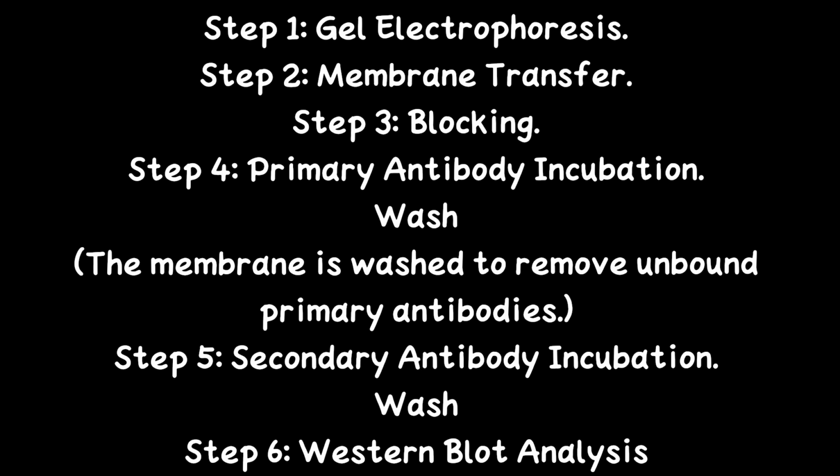that is, analysis is available. So the separation is by SDS-PAGE, blotting is transfer to the membrane, then it is blocked, which prevents non-specific binding, antibody 1 is the primary, and then binding of antibody 2, the secondary, with the enzyme, and detection, that is from the substrate, finally the visible bands are observed.